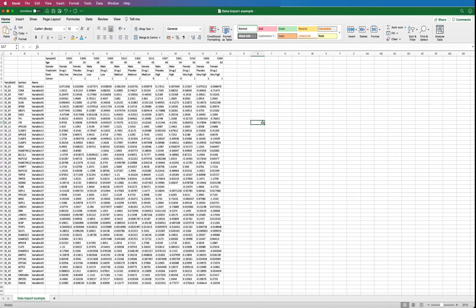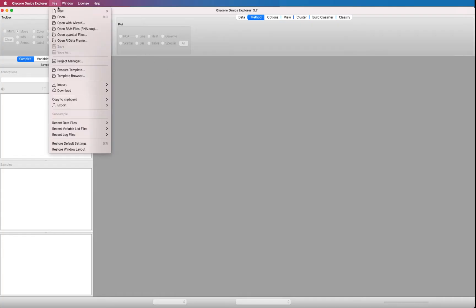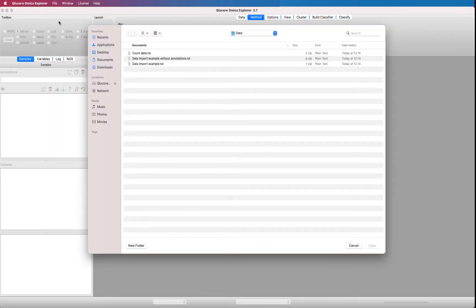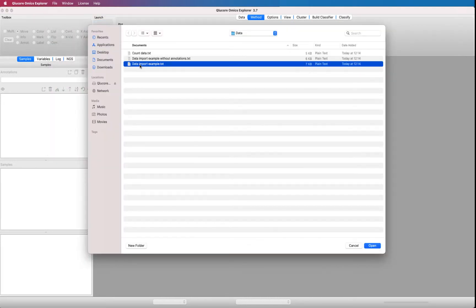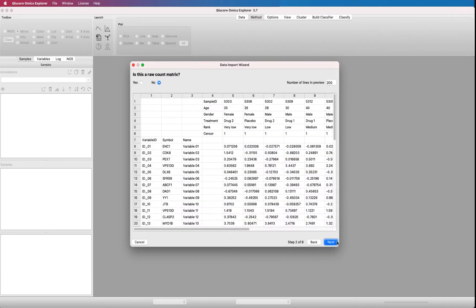Let's start. We open the file with the open with wizard option from the file menu. That opens up the wizard and we step through the wizard using next and follow the instructions. First question. Is this a raw count matrix? No, this is a normalized data. Press next.